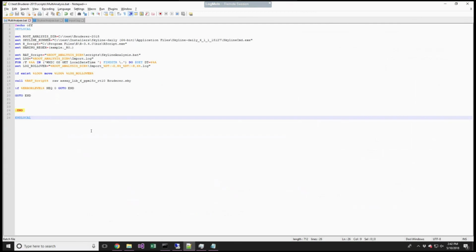Yes, at this point, the server has to run Windows. We have it in our sites and in our last grant to try to get this over to Linux. There's a new version of .NET that'll run on Linux. And so we think that the command line version should be able to run on Linux, but we haven't done that work yet. If you know a developer who might be interested, just send them our way.